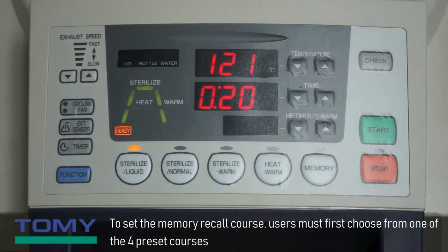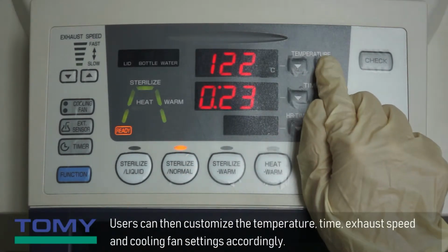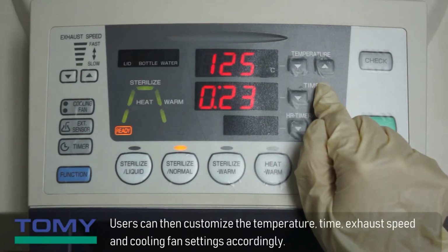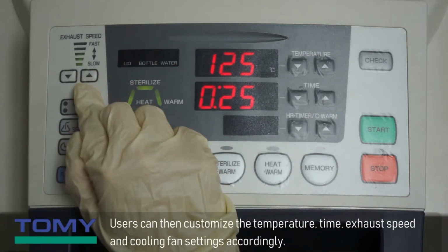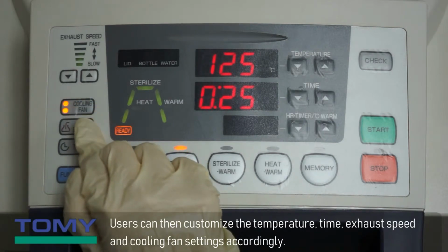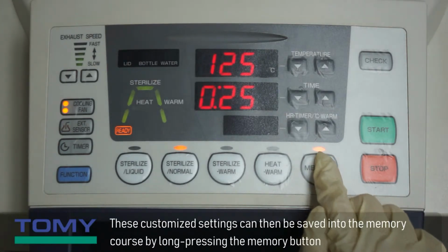To set the memory recall course, users must first choose from one of the 4 preset courses. Users can then customize the temperature, time, exhaust speed and cooling fan settings accordingly. These customized settings can then be saved into the memory course by long pressing the memory button.